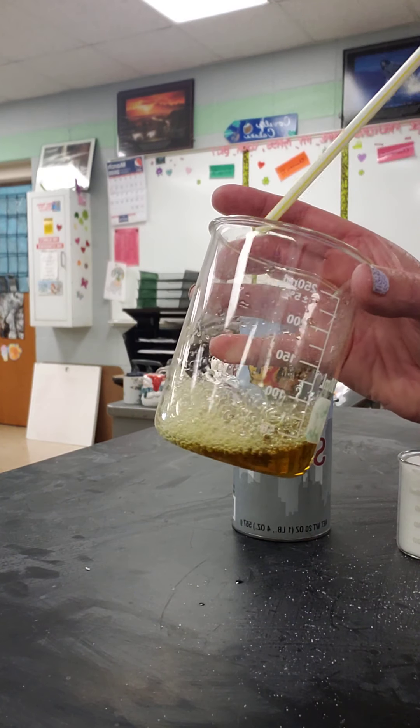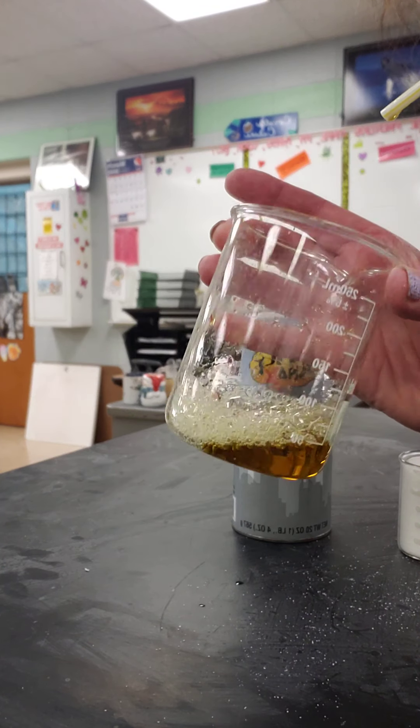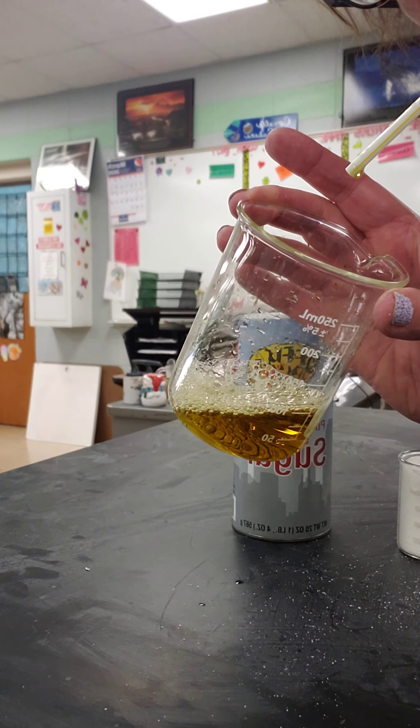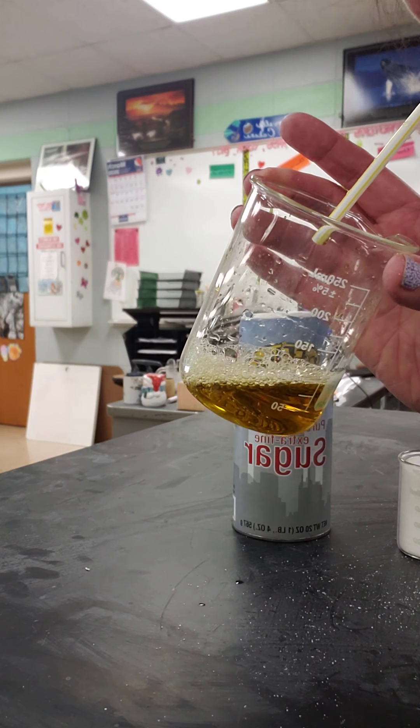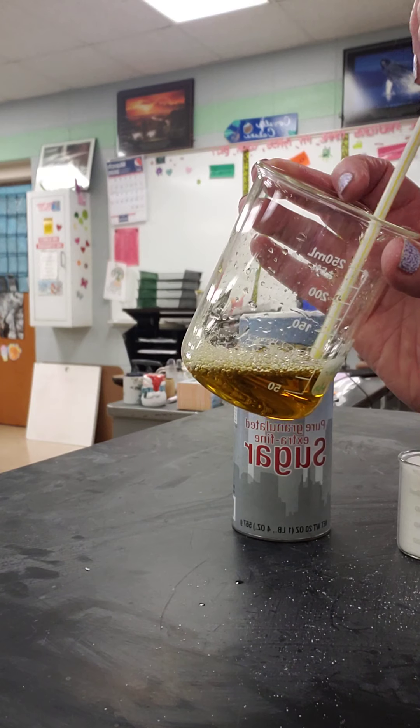All right. So it turned nice and yellow. That means that I breathe out carbon dioxide because my cells are doing cellular respiration.